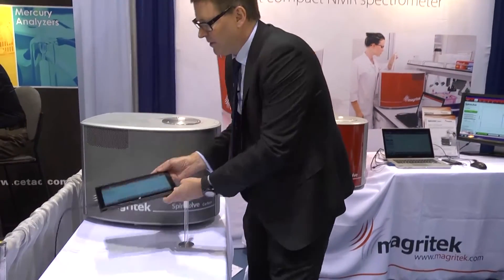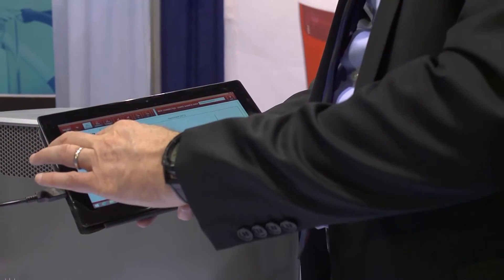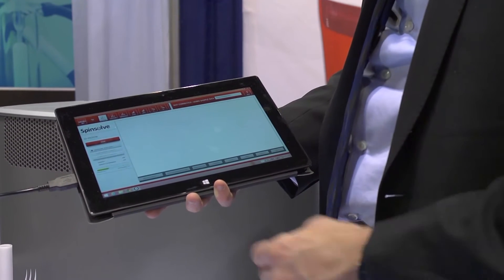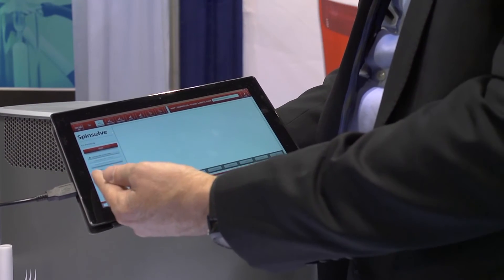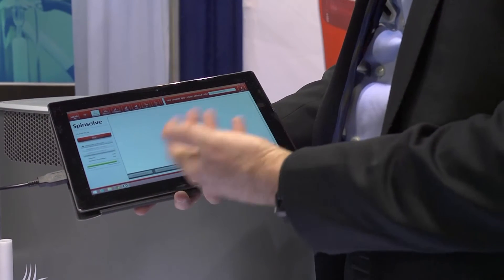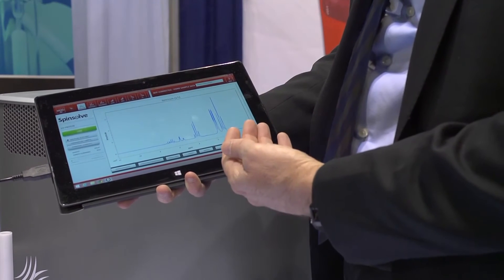To operate the system there's a very simple interface here. Most of the experiments can be started just by clicking the start button and the system will start acquiring the NMR spectra. At the end of the experiment we get a beautifully resolved carbon-13 NMR spectrum, and you can resolve a single peak for each of those carbon nuclei.